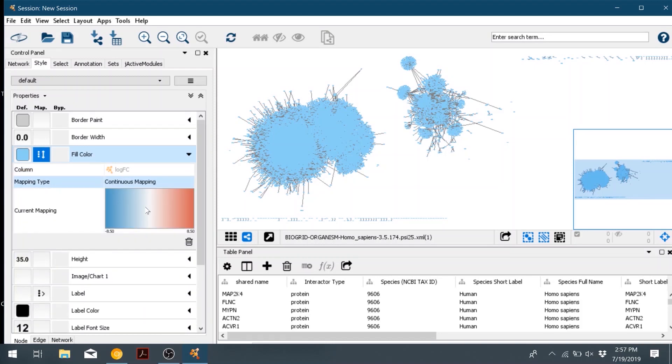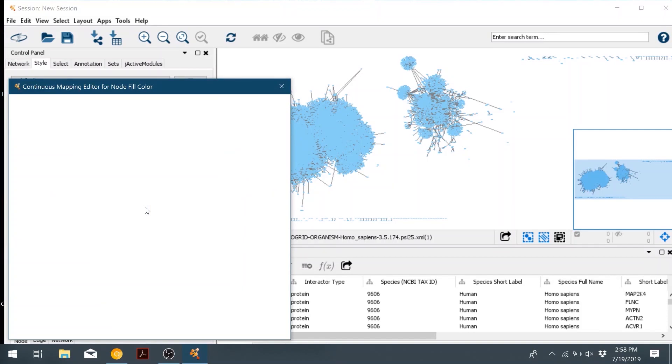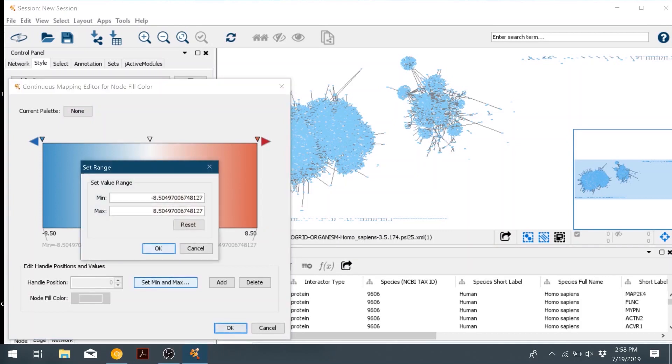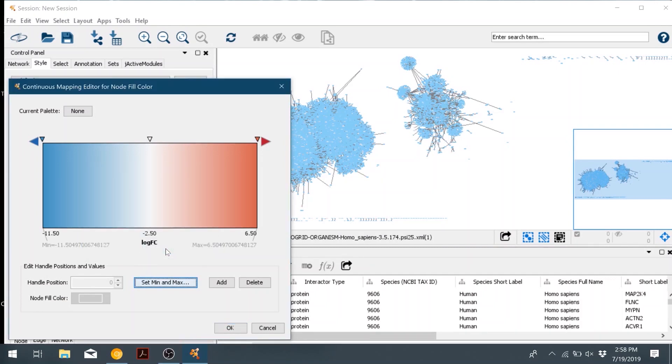If you double click on the color gradient, a new window will pop up. You can go ahead and click the set min and max value. I already know the min and max value for this data set, so I'll go ahead and change that.